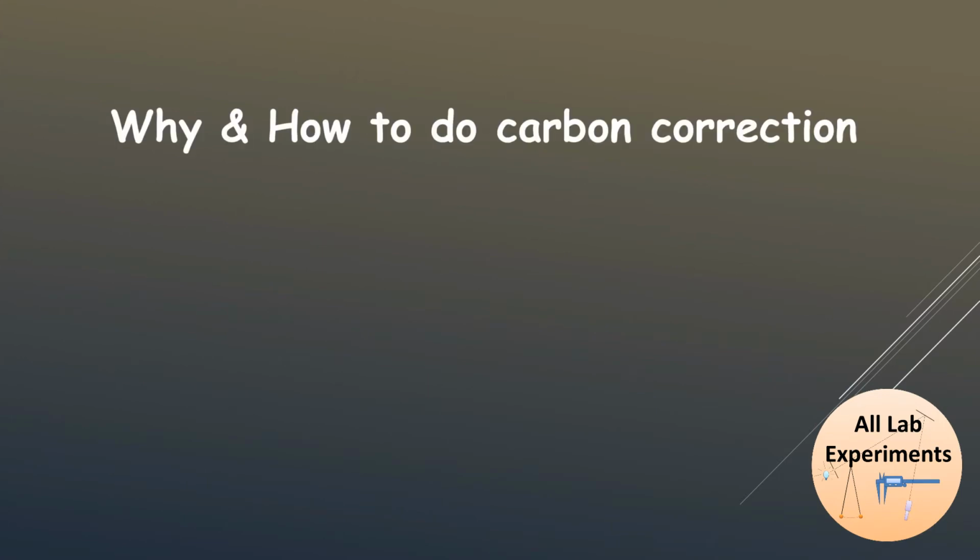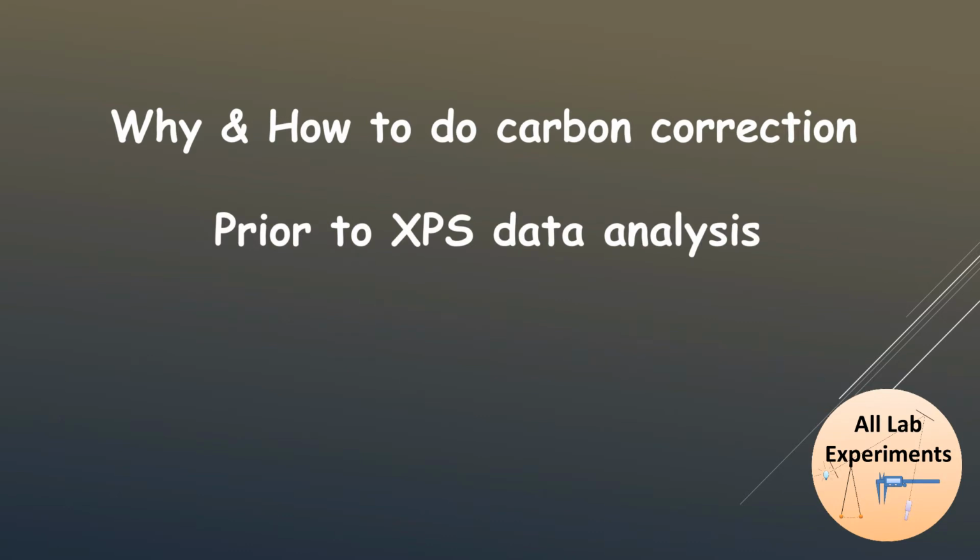Hello friends, today we are going to learn why and how to do carbon correction prior to XPS data analysis. So first of all, we are going to study why to do carbon correction.